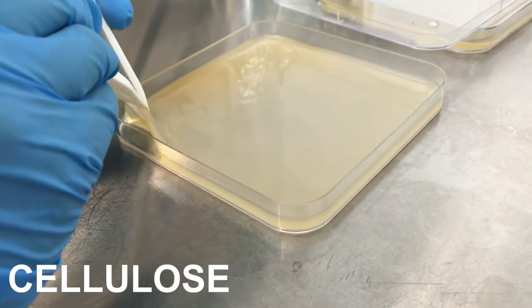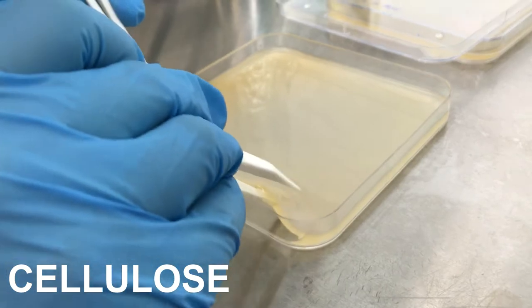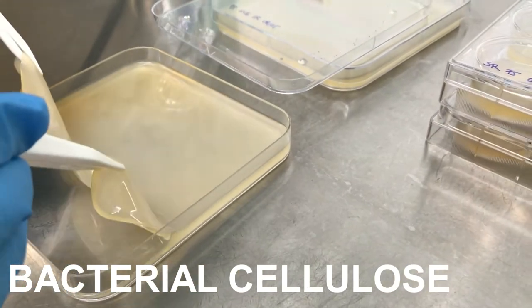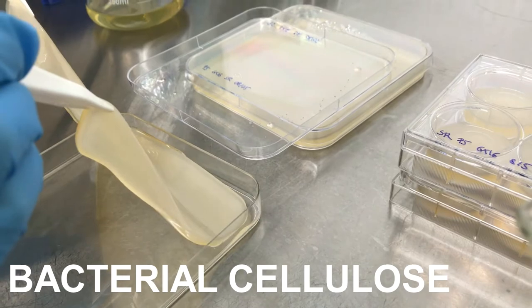In our lab, we can also make cellulose. This is a film of bacterial cellulose. And how do we produce it? With sugar and bacteria!